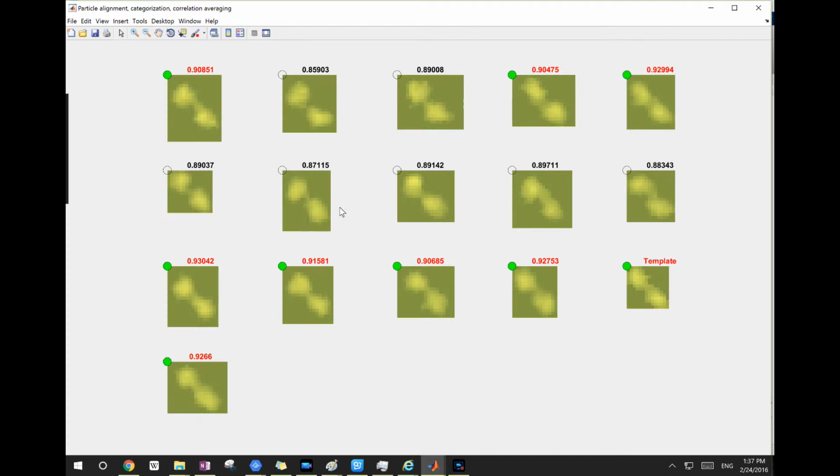So you can also use a lower correlation coefficient, like 0.85. It will be a bad match versus the template. But I actually think this is computer-calculated results. Apparently, some of them I would like to think are a good match, including this one. Maybe this curvy one I wouldn't use, but I think these ones are a good match.